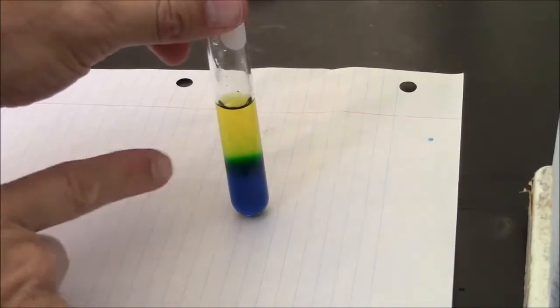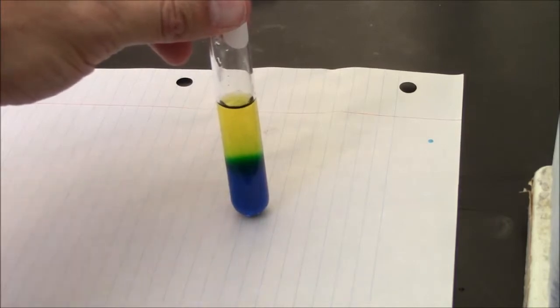Here I have a very nice 2-layered effect. Yellow is less dense, blue is more dense. Needed to use pipetting to make this happen.